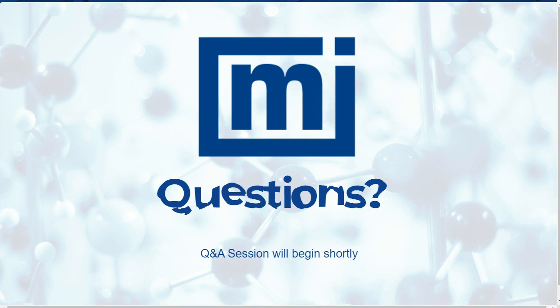Great. Thank you. I think there's time for one more question. So we've talked a lot about this moisture testing, and there's been several questions on that. So I'm going to move away from that and ask on the opposite end, how do we deal with static electricity between our powders, potentially sticking to the sides of the walls of the instrument? Absolutely, yeah. So, there are two questions here, really.